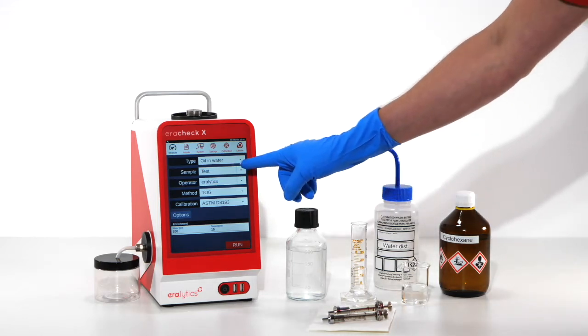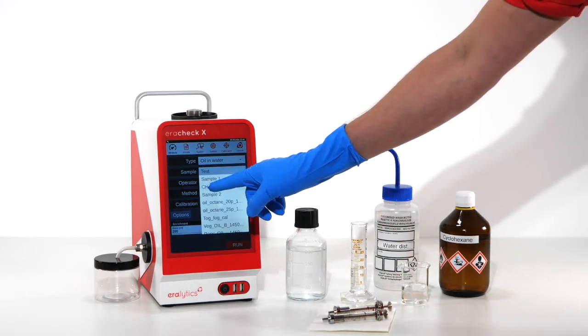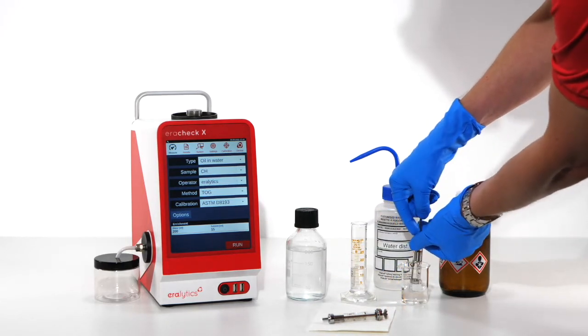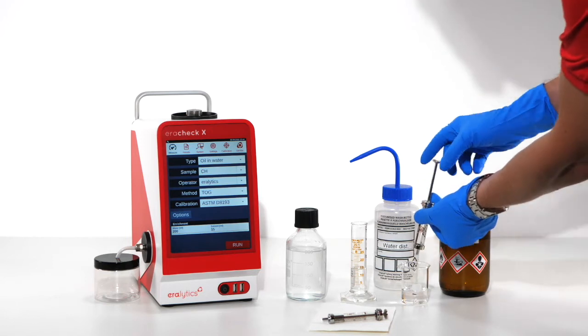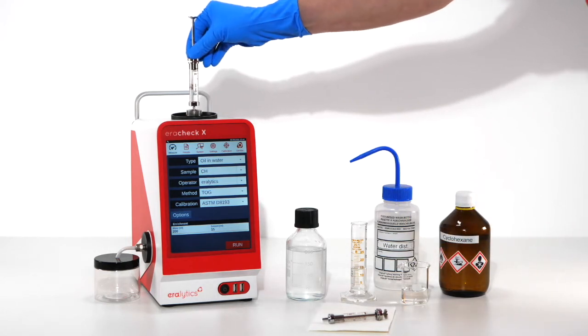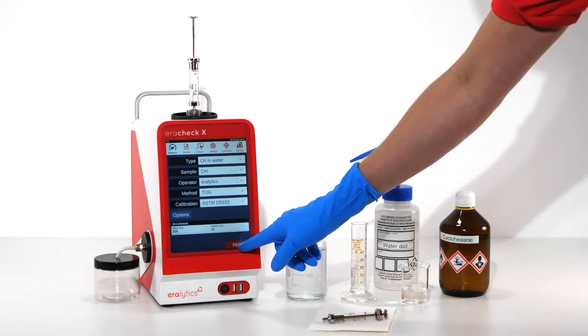Enter CH for cyclohexane as sample ID and fill the provided syringe with fresh solvent. Attach it to the inlet assembly at the top and start the measurement by pressing the run button.